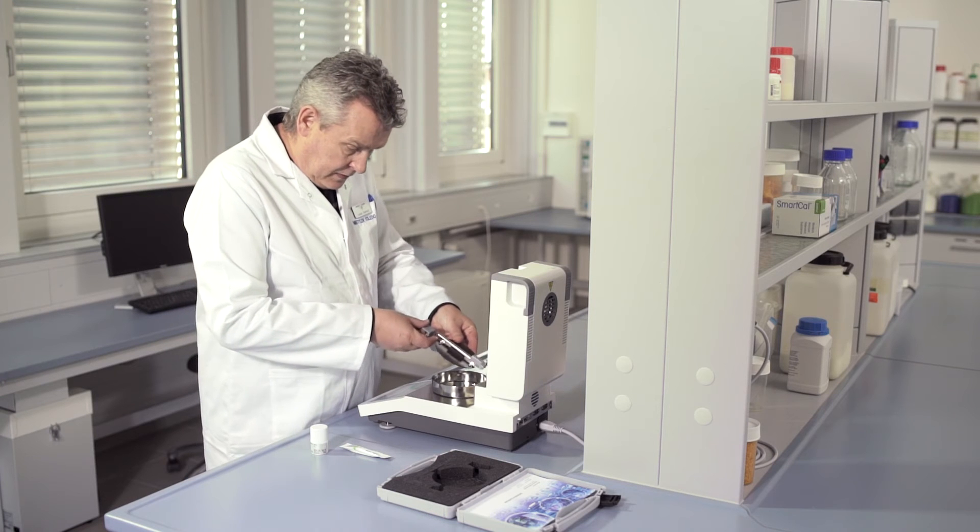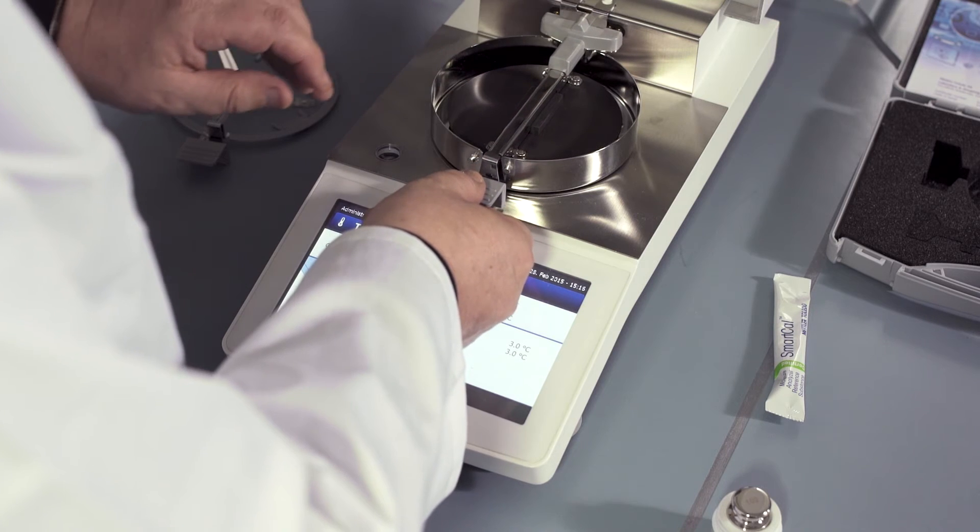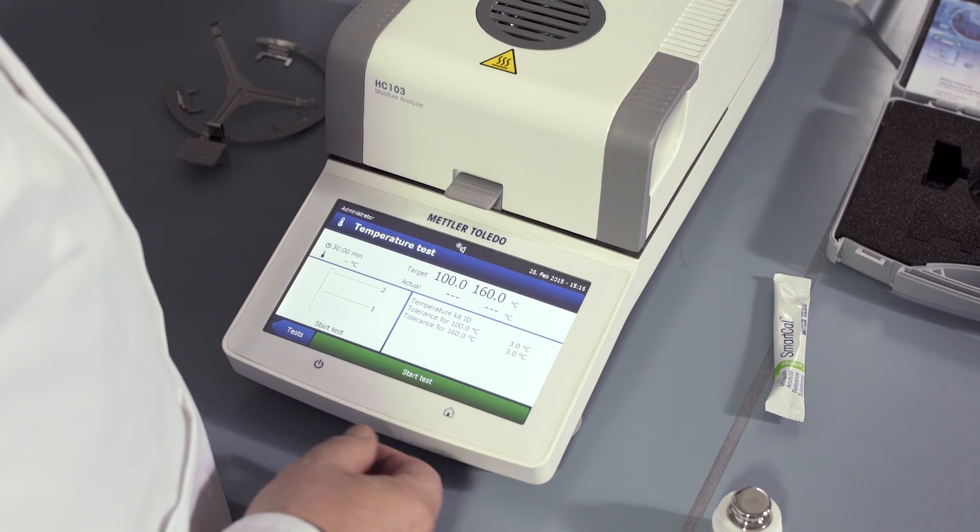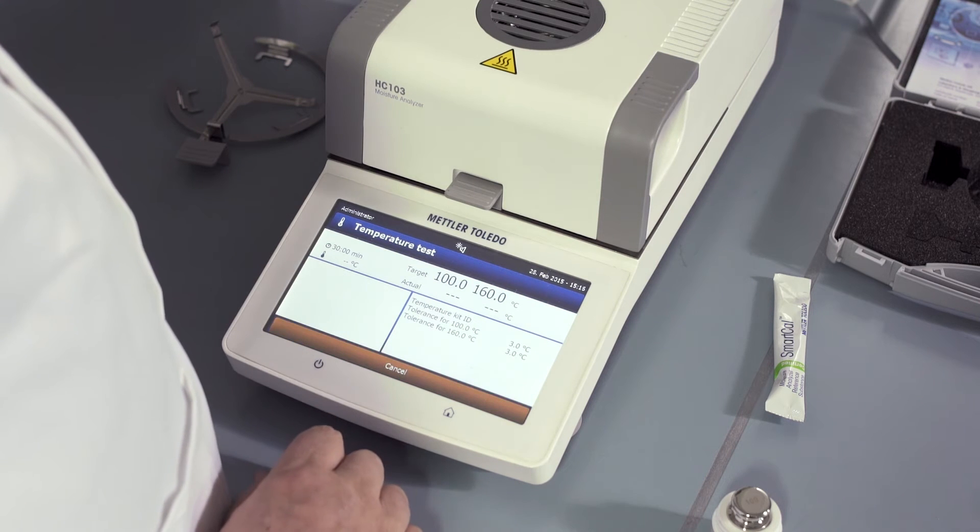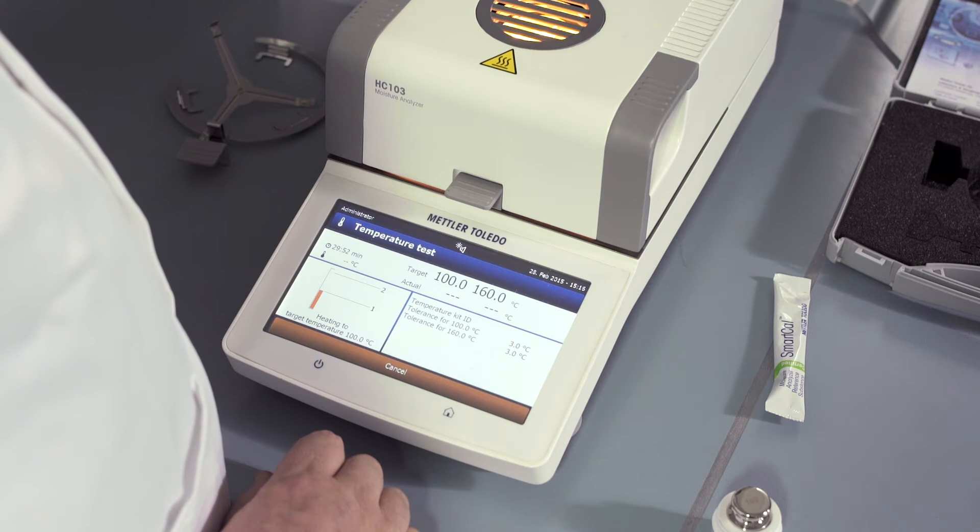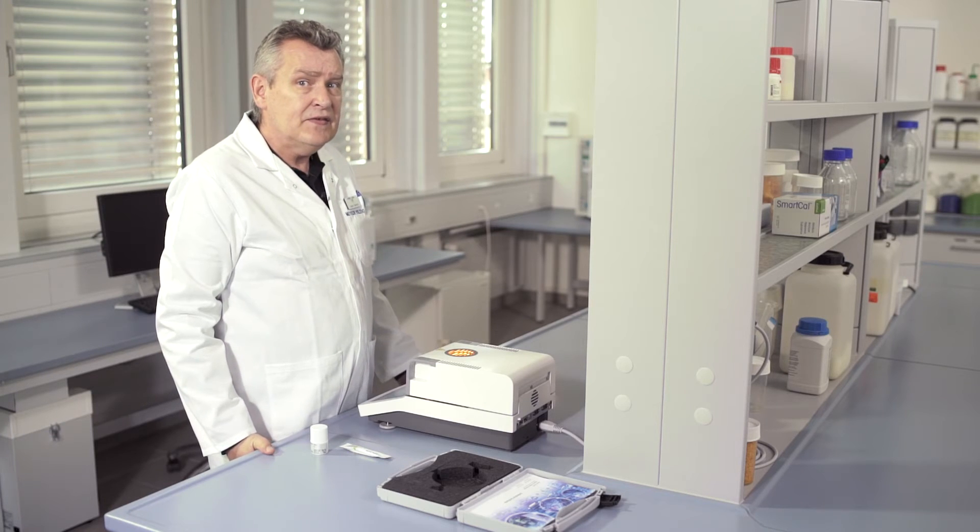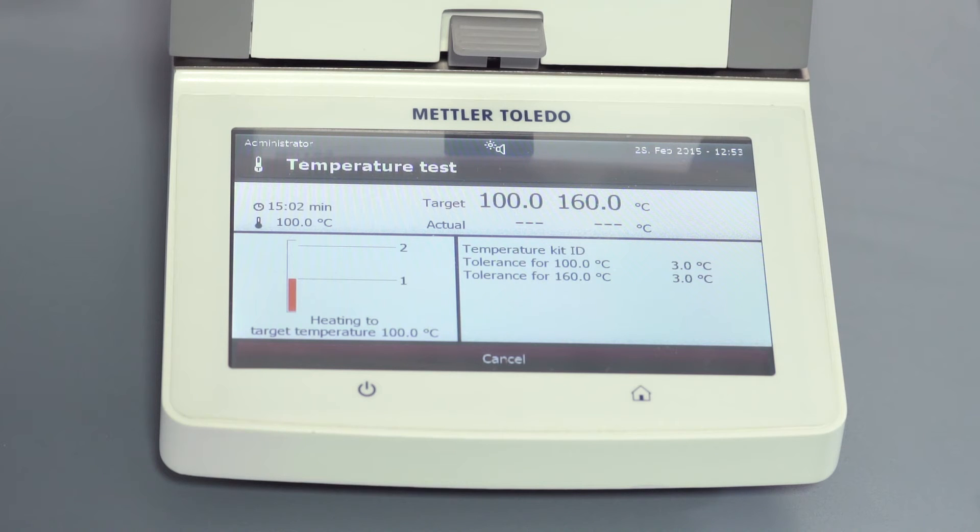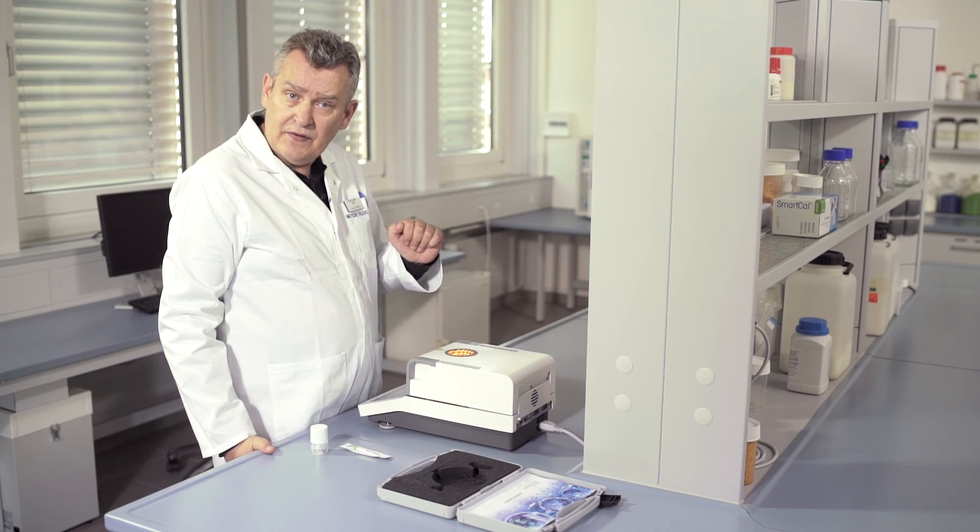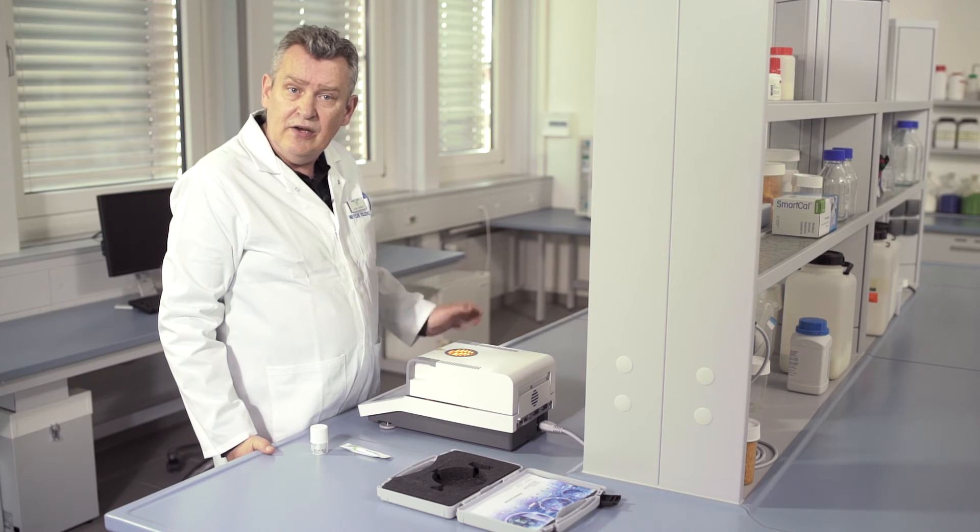The instrument instructs you to place the electronic temperature calibration kit like so, then close the lid and start the test. The temperature is tested at two points: at 100 degrees centigrade and at 160 degrees centigrade. After 15 minutes, the temperature at the first point is automatically read, and then the instrument will heat up to 160 degrees for a further 15 minutes and then the value is automatically read again.